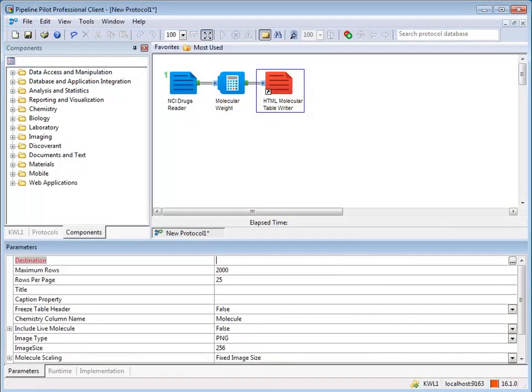When you know you are going to want to use a protocol in Webport, you can set it up so that it will display and run in the interface. We'll now review setting up a Webport-friendly protocol.